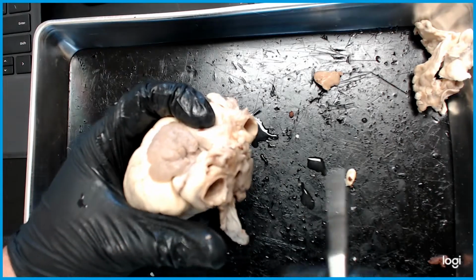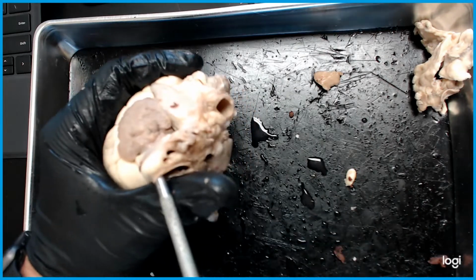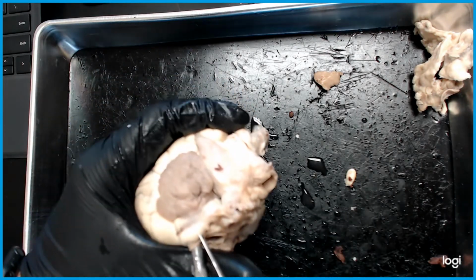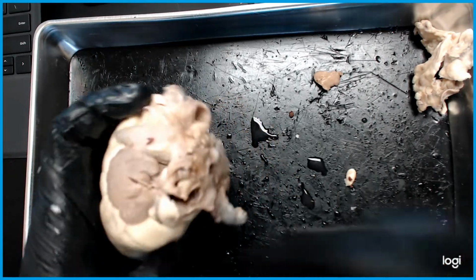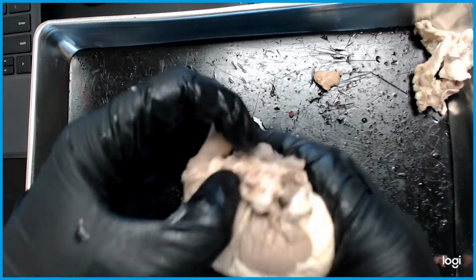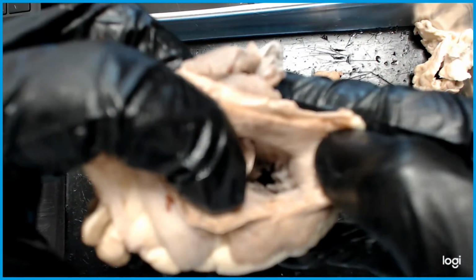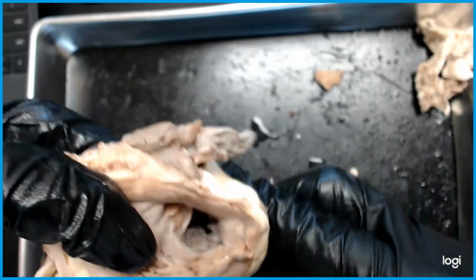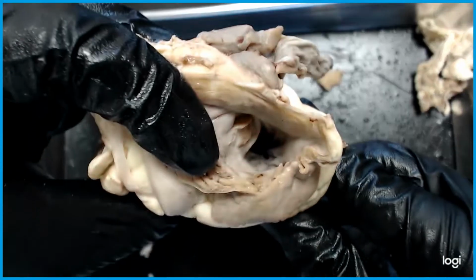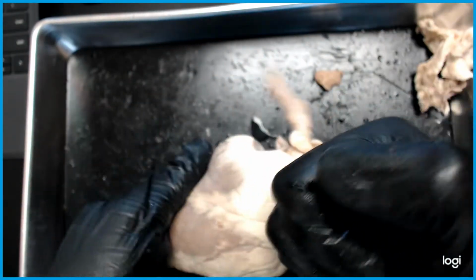So we're going to go towards, remember you can always use the probe as a guide. And we're going to open up towards the atrium. So now we can look in there. You should be able to appreciate some of the valves, which we already put our fingers through, but if we squeeze the heart a little bit, you can see the way they close. Right in there.